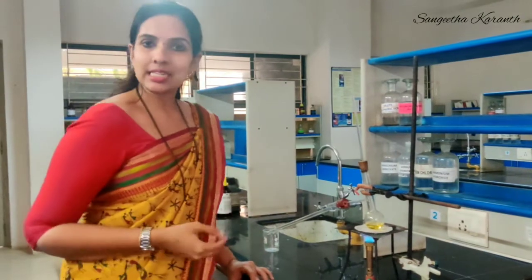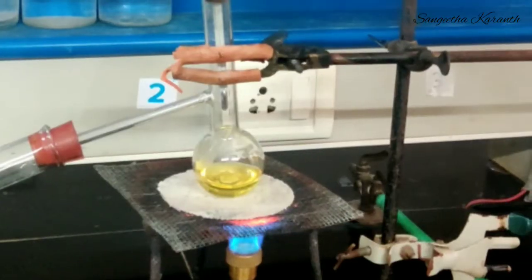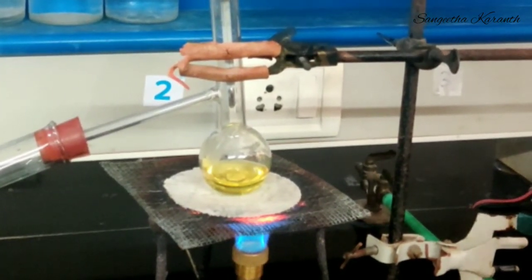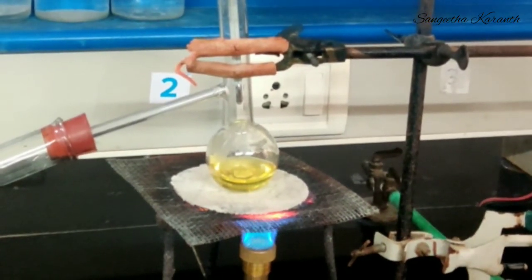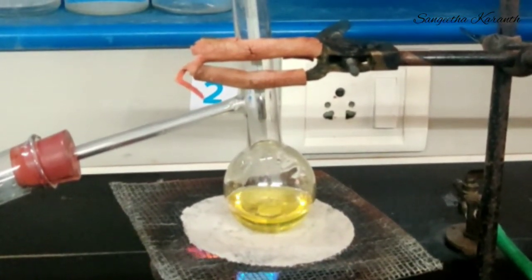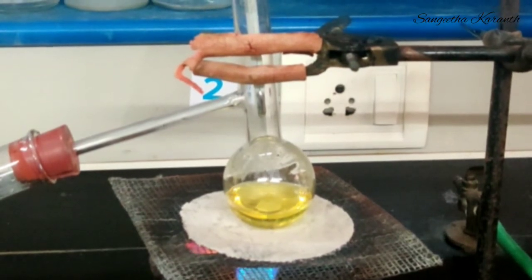As it is heated, we need to concentrate on the temperature shown by the thermometer. We have to see when this liquid will start boiling, convert into vapors, and the vapors start collecting in the beaker. Now if you observe, the liquid has started boiling, and you can see the vapors getting formed within the RB flask. You can see the walls of the RB flask and the vapors being formed.